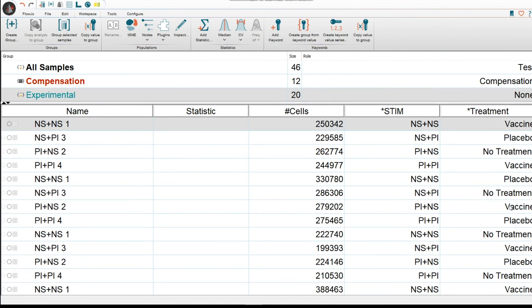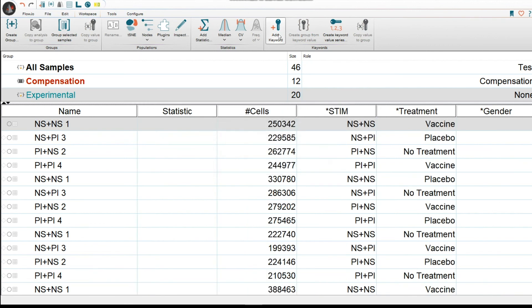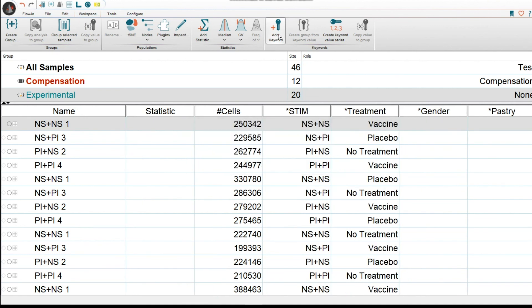Now, what about if you want to get keywords from Excel? We could also do that. So let's say let's create two keywords here. So we're going to go to Add Keyword. Then we're going to type in, let's say, asterisk gender. And then we're going to add another keyword and say asterisk pastry. This is just for general purposes.